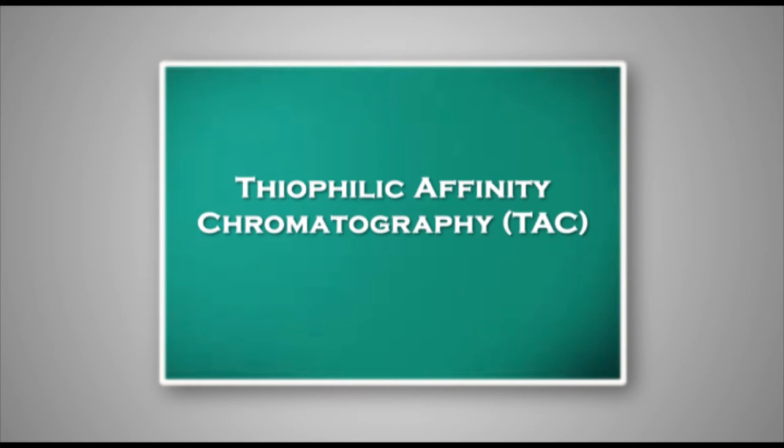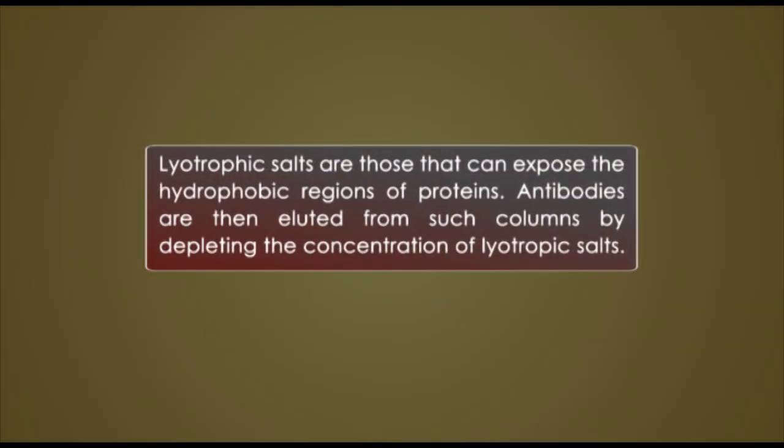Thiophilic affinity chromatography or TAC. It uses sulfur-containing ligands like mercaptoethanol in divinyl sulfone activated matrices, which show salt-promoted selective adsorption of proteins. Such matrices have high affinity for antibodies in the presence of high concentrations of lyotropic salts. Lyotropic salts are those that can expose the hydrophobic region of proteins. Antibodies are then eluted from such columns by depleting the concentration of the lyotropic salts.